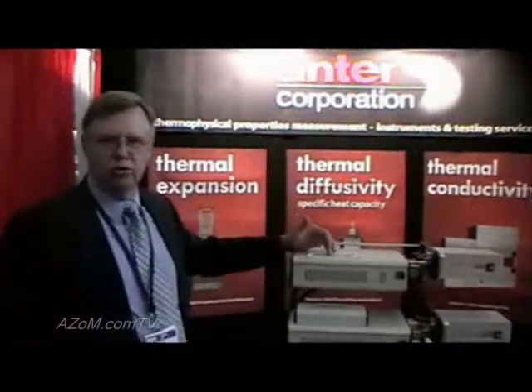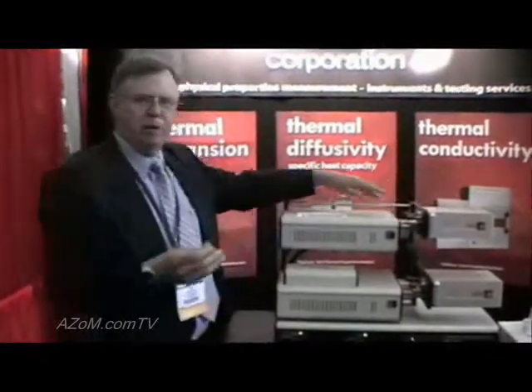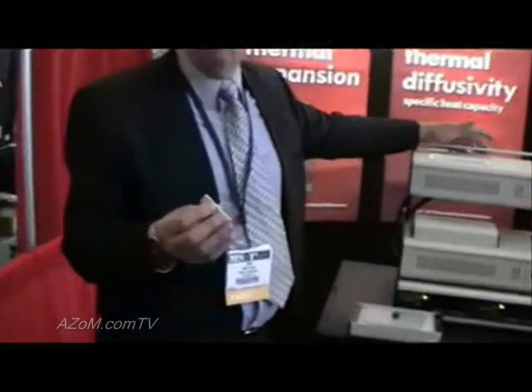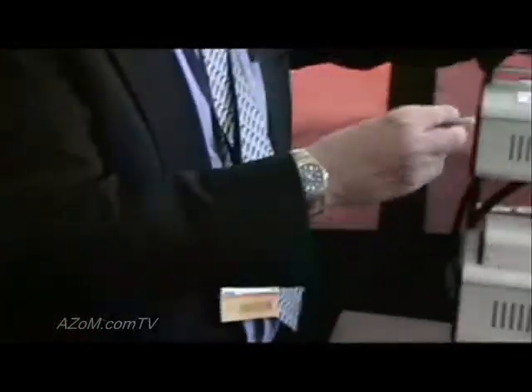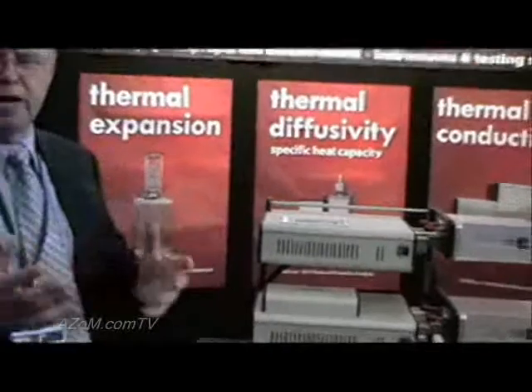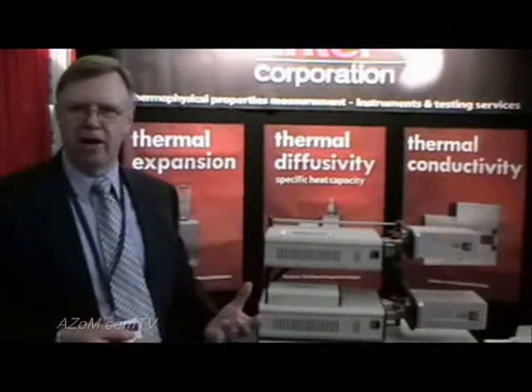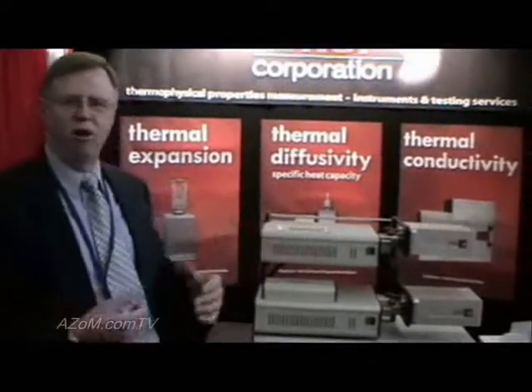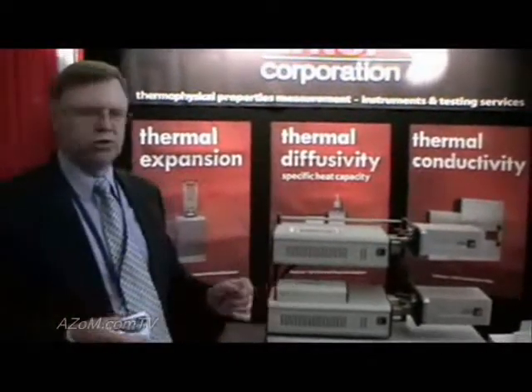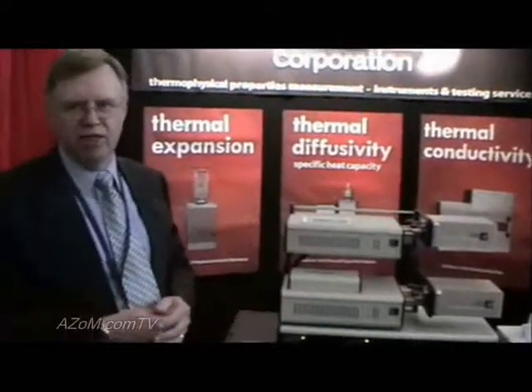We can also measure conventional size samples, typically 50 millimeters long by different cross sections. It's all computer controlled — we set up on the PC the sample information, sample size, the temperature range, and having selected proper calibration, we can automatically run four samples, walk away, come back later, and look at the results. So it's a high throughput machine.